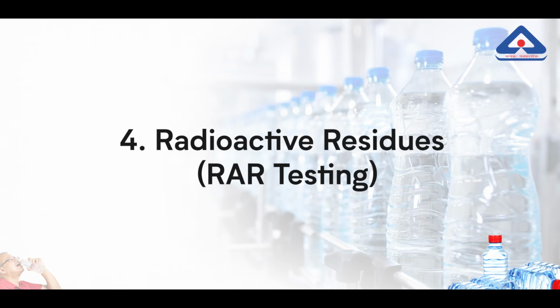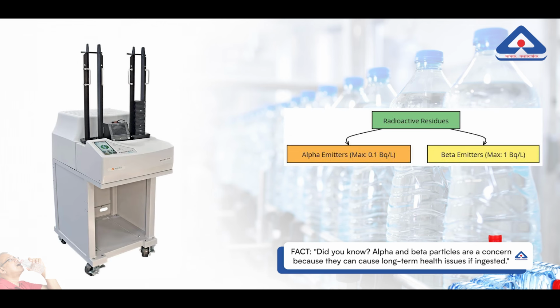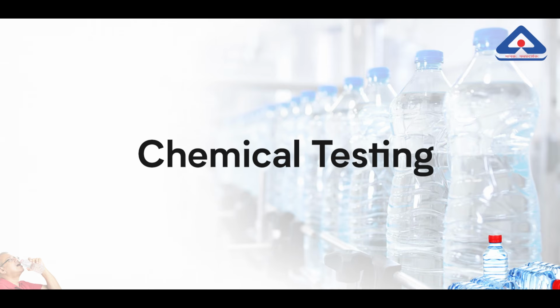4. Radioactive residues, RAR testing. Radiation testing ensures the water is free from harmful radioactive residues by measuring 2 critical parameters, alpha and beta emitters. Now let's explore each test, starting with chemical testing.